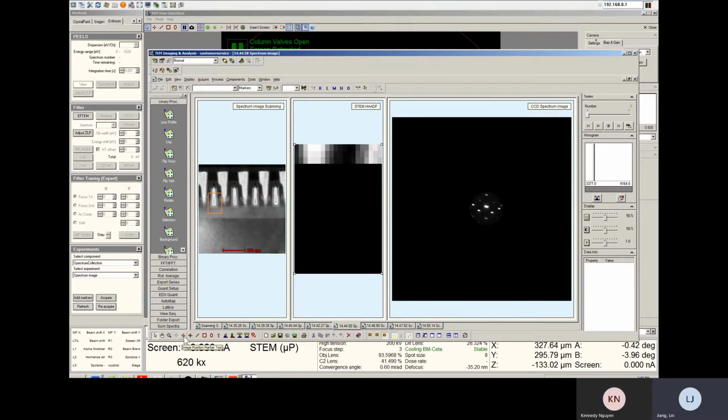So you can select this one, this two, and put there. And you say right now you need, and then you select, push the alt button in the keyboard. Press that button and then drag this one to the diffraction imaging, CCD imaging. This will correspond this spot with your diffraction pattern on the CCD. And then you can move around.